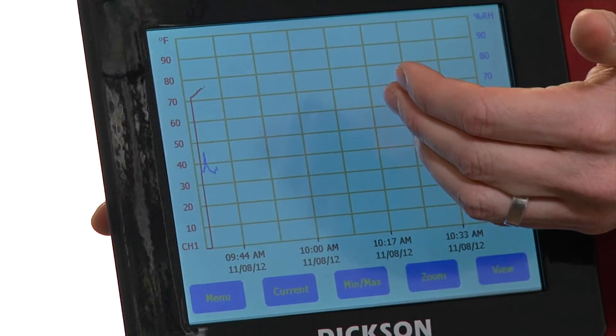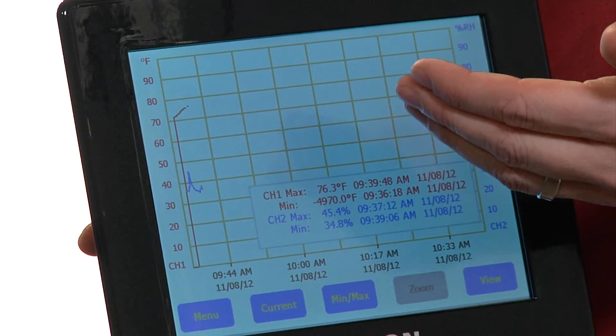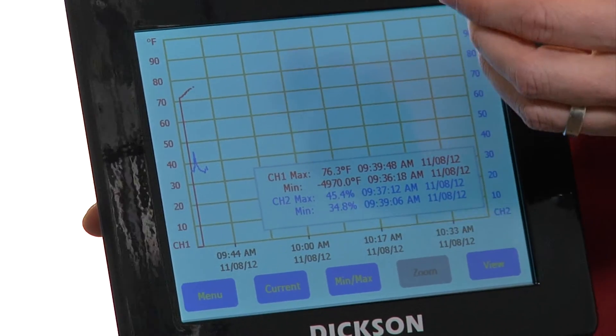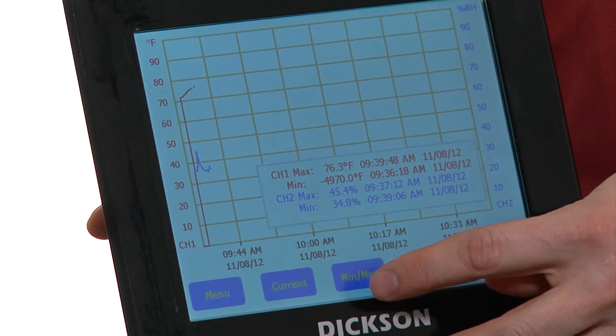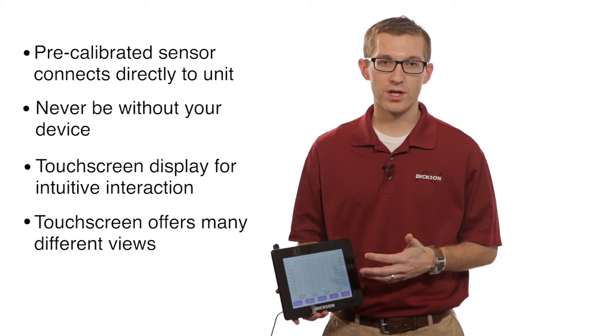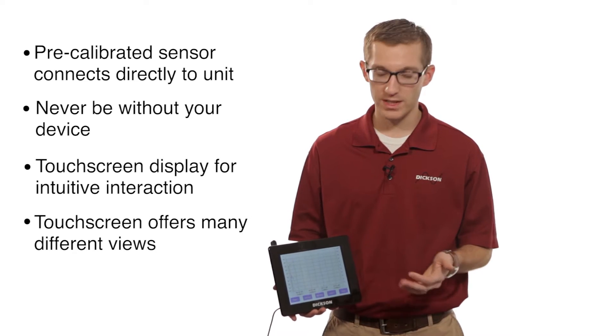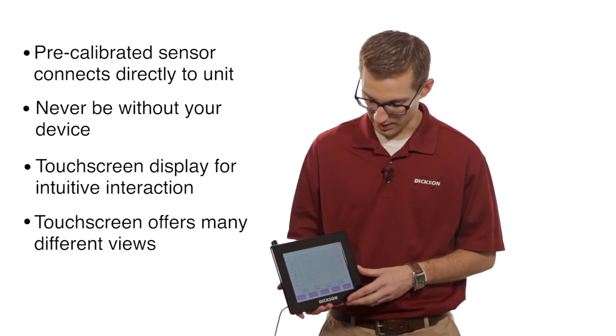If we go back to the main screen here, you can see we have a couple other things. The Min and Max button, which shows you your high and your low temperature, and your high and low humidity readings. This is really nice — if you leave on the weekend and come back in, and you want to know what the maximum or minimum temperature was, or the maximum or minimum humidity, you can easily see that on the display.